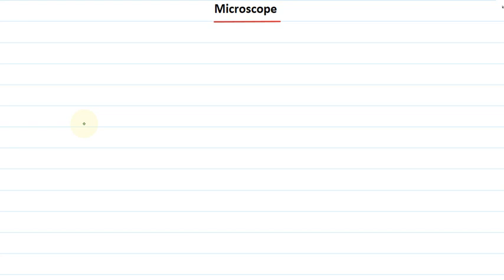The topic for today's video is microscope. So to begin with, we would see what is a microscope. Okay, so we would begin with the introduction. First we would understand the introduction of microscopes. That is, what is a microscope? We must be knowing. So what is microscope or what are microscopes?